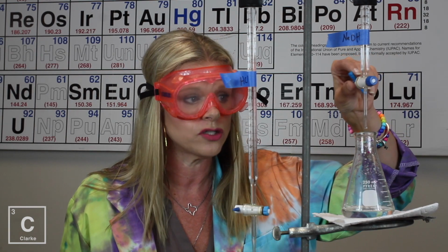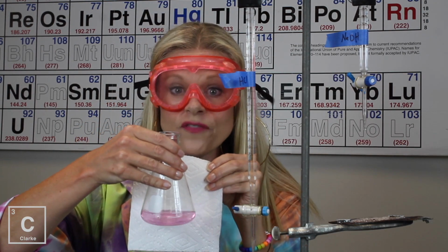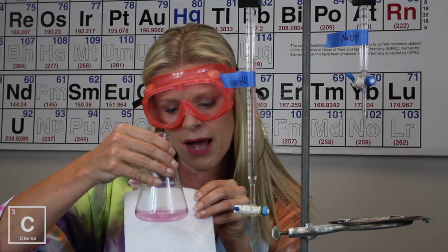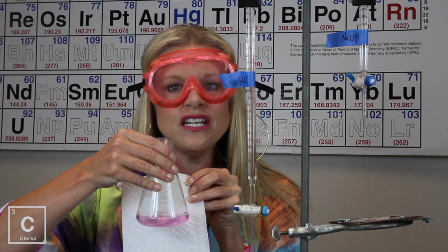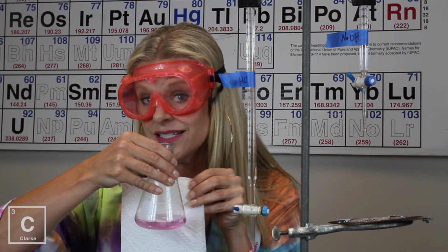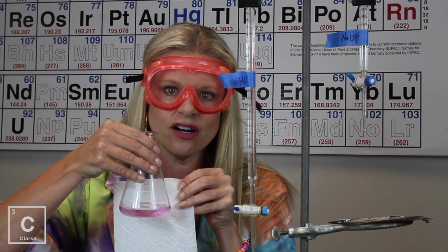So I know I'm so close. I'm going to try just to get one drop of base. Look at this, we're finally here. We've got the faintest hint of pink. I'm holding this white paper towel behind it, so hopefully you can see. Faint pink. That means we are right at neutral. Maybe just the tiniest bit above neutral, slightly basic, but this is as close as it gets, y'all.